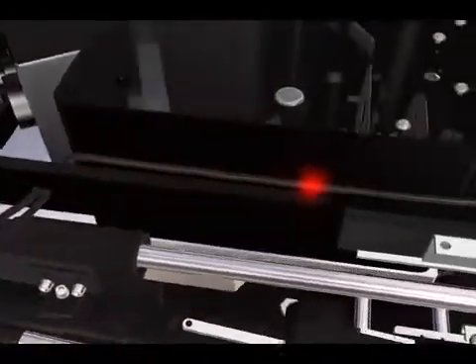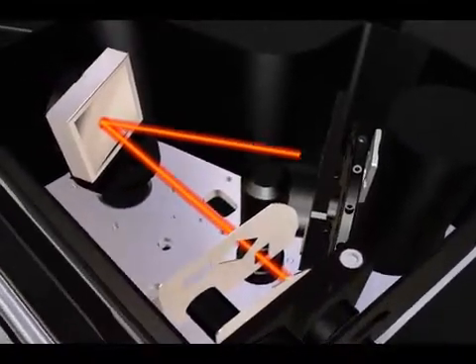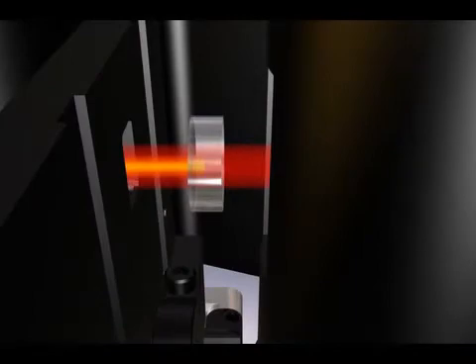Selecting the emitted wavelength presents you with similar challenges that SpectraMax is ideally suited to. Once the wavelength is tuned by the monochrometer, the cutoff filter is automatically engaged before the light goes into the Auto-PMT. Our patented Auto-PMT allows for the maximum range of high and low signals without the need for reference wells or manual gain settings.